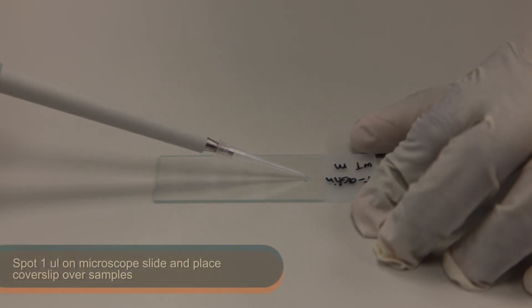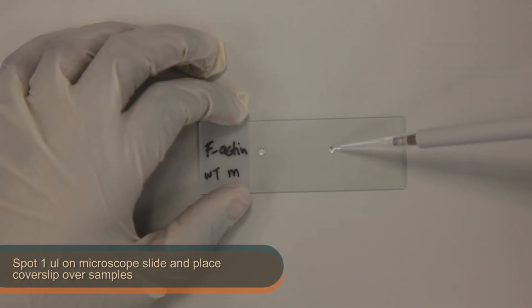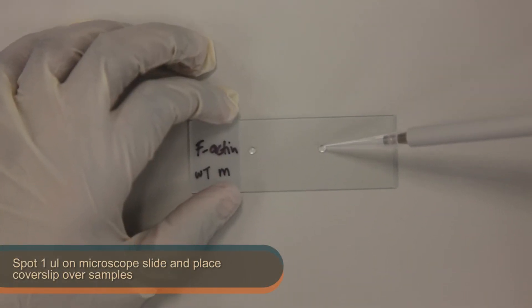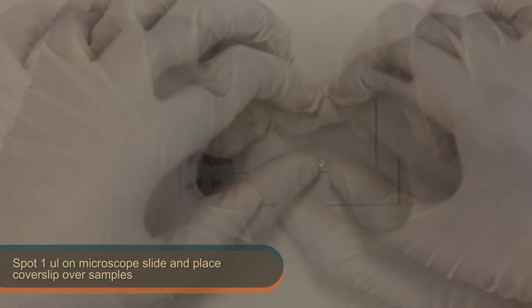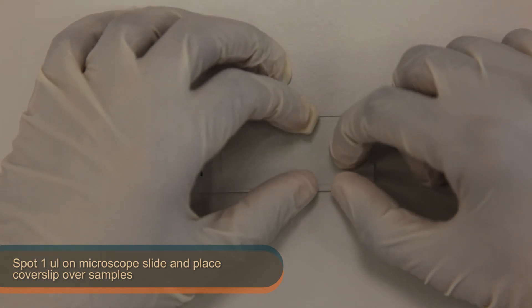Then, spot 1 µl of cell suspension on a microscope slide and place a coverslip over the sample's cavity. Make sure there is ample space for both samples on the slide.